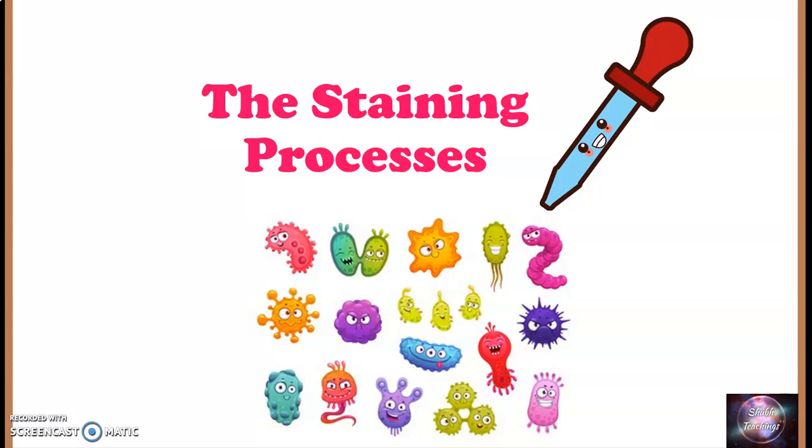Hello everyone. In this video, we will learn about the staining processes, the major staining process which is the Gram staining process. We will discuss that in detail. Also prior to it, we will learn what the staining dyes are, their types, and how they react with the biological components to give a particular stain. So let's begin.